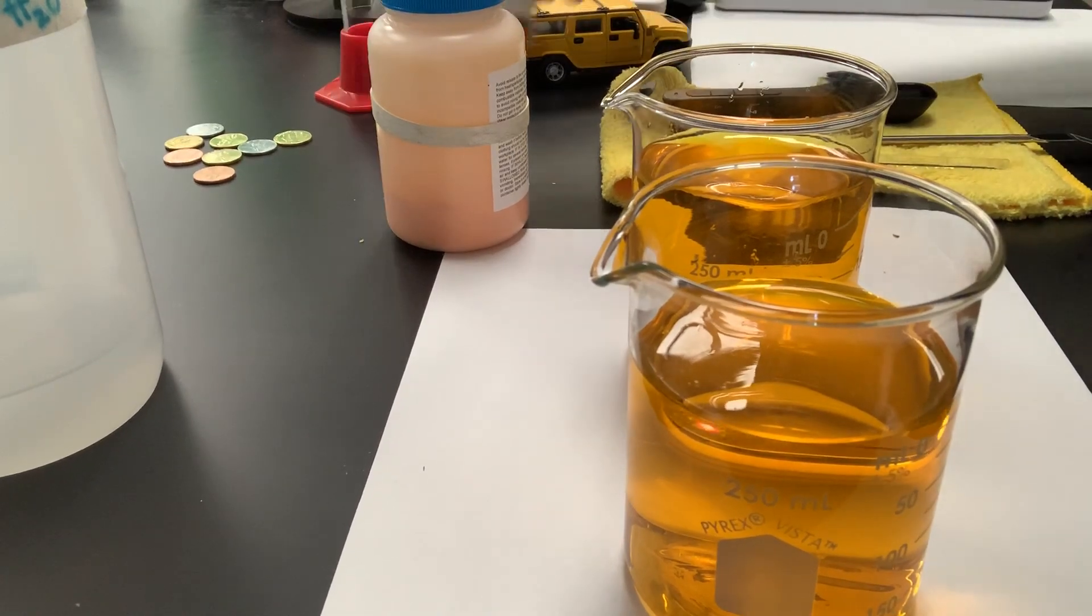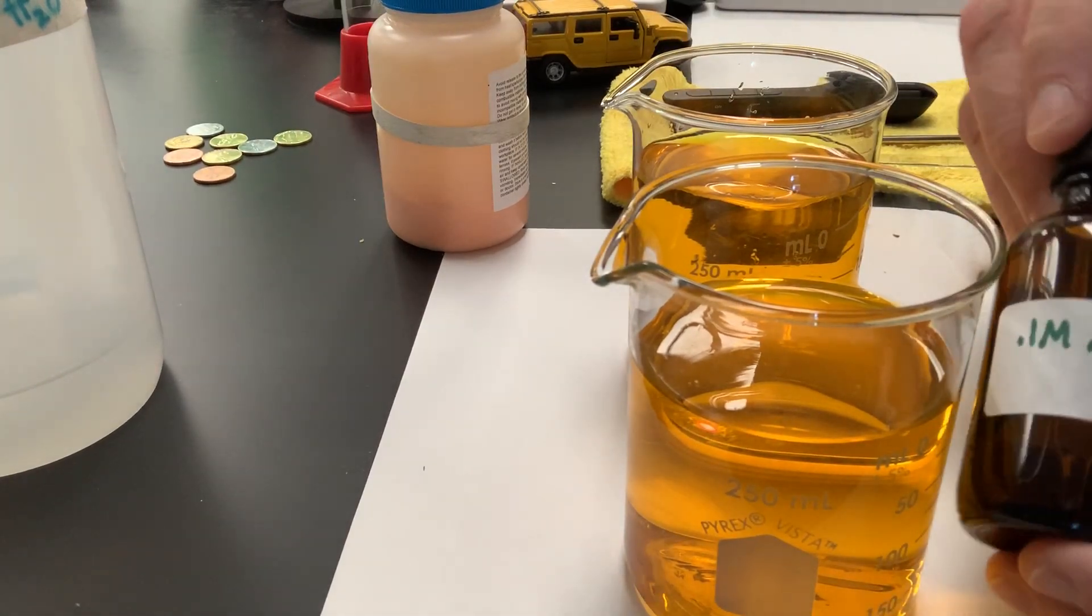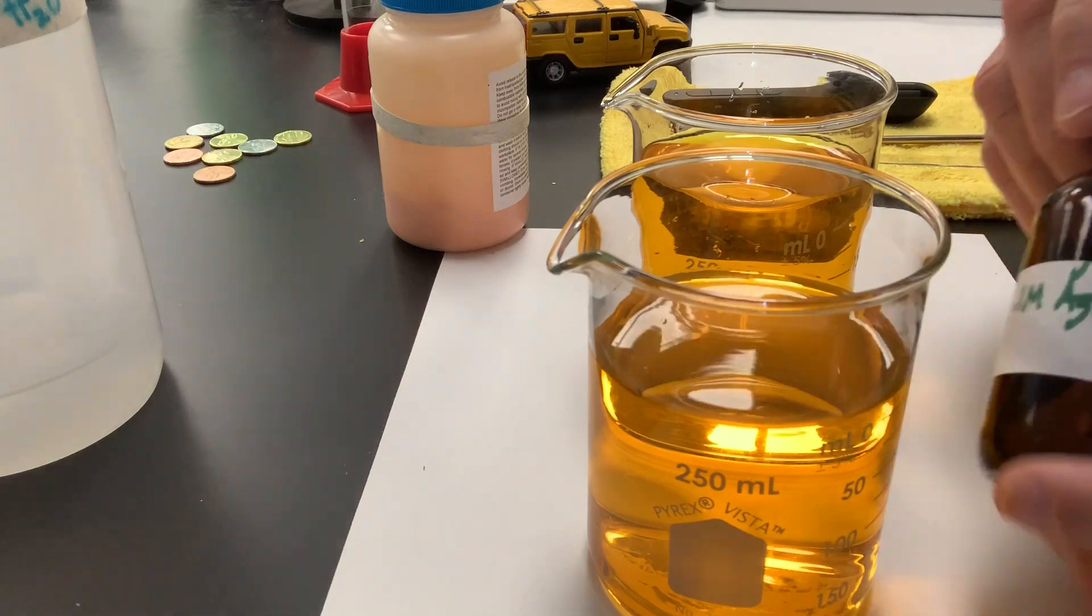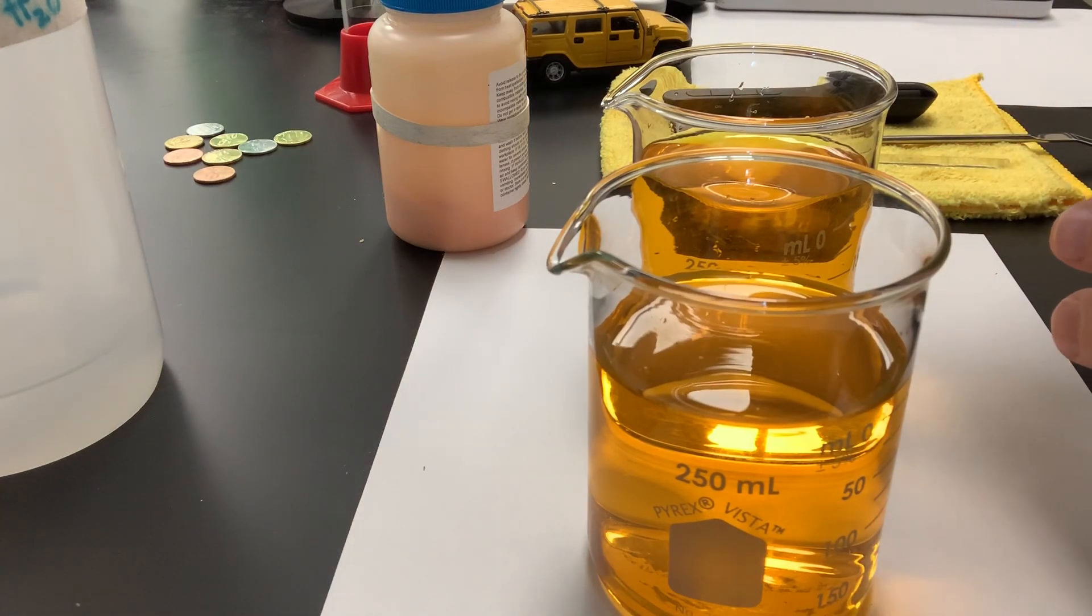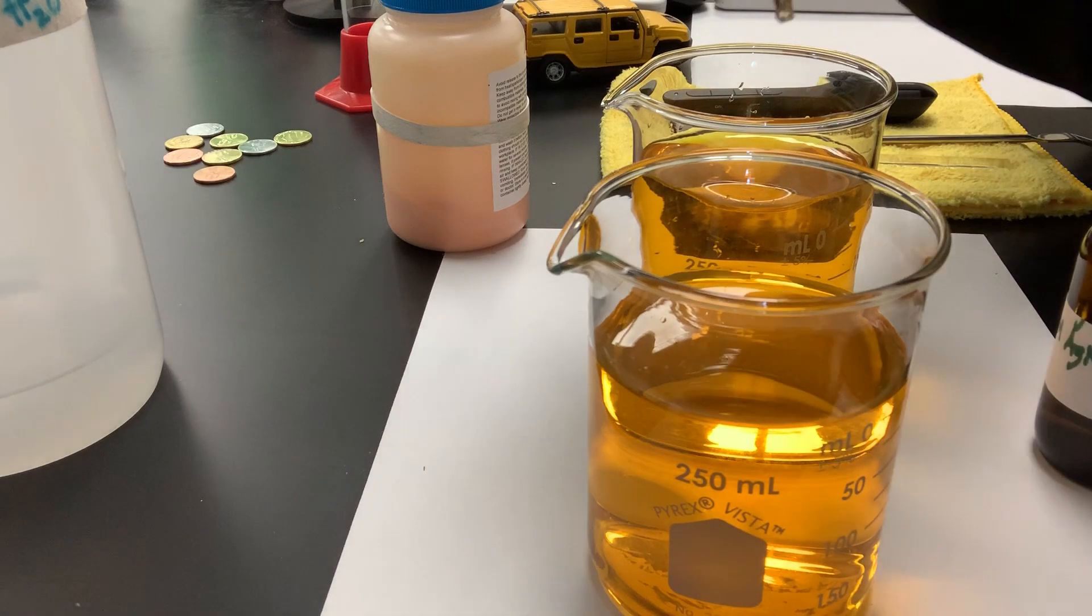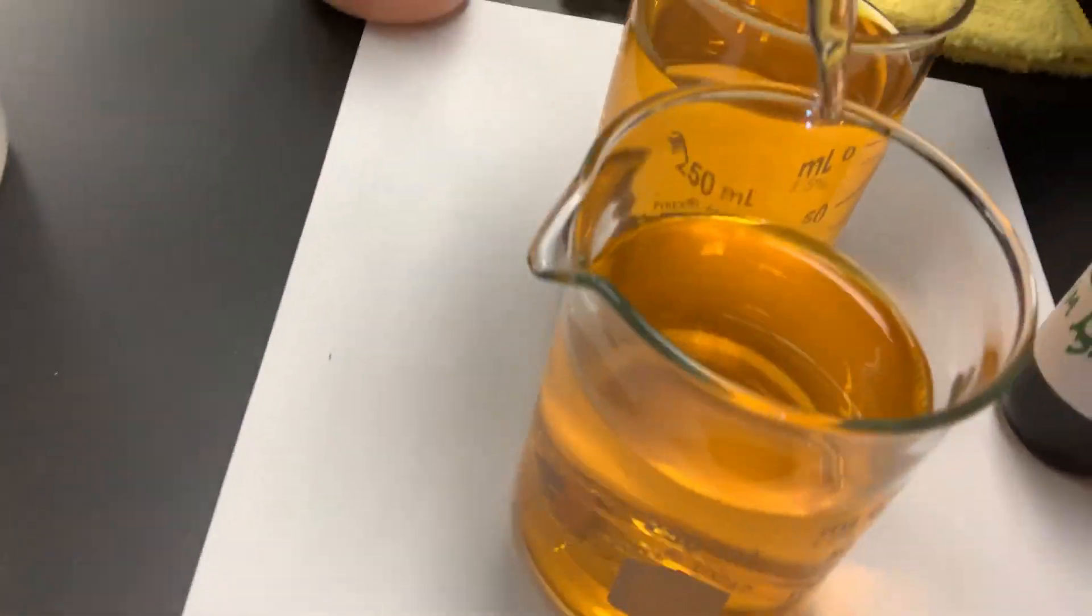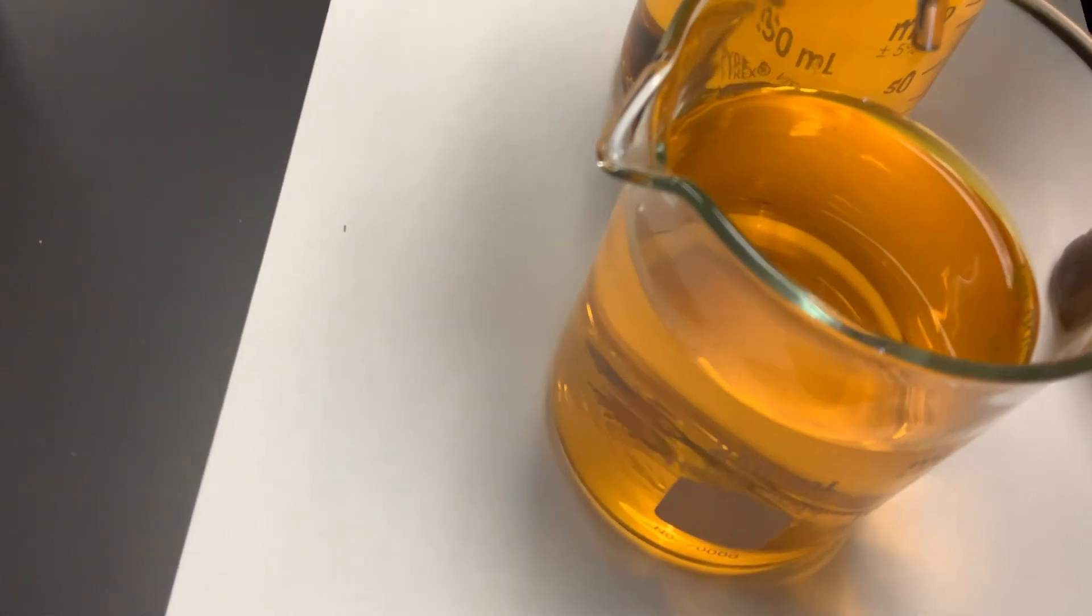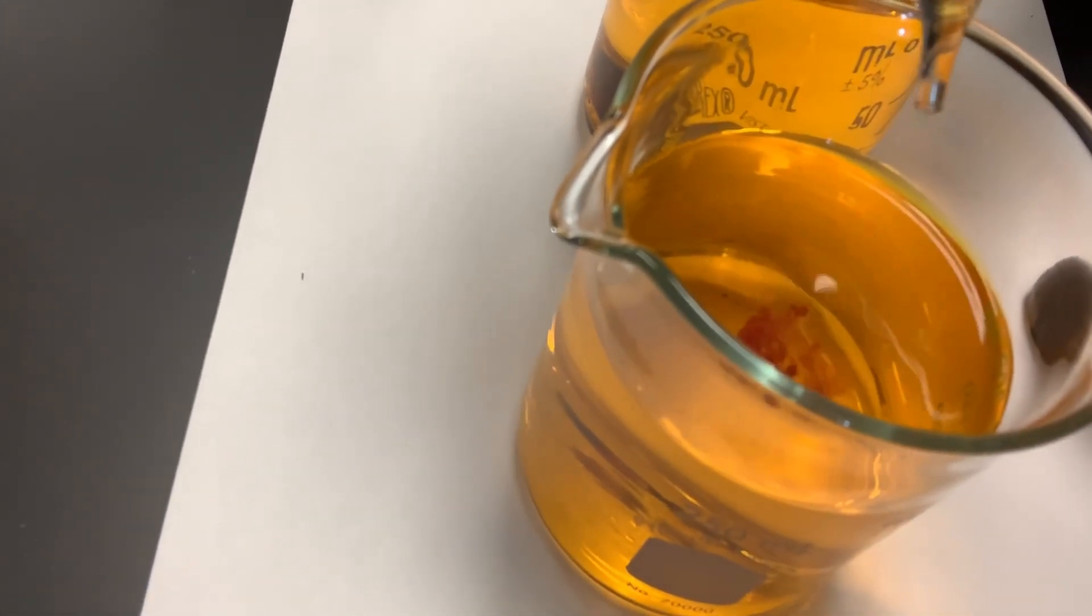To one of the beakers now, I'm going to add another homogenous mixture. This is silver nitrate dissolved in water. And I'm just going to add a few drops to one of the beakers. And we're going to form what's called a precipitate. It's a solid forming in solution. Sort of fun to watch. So I'll put the camera over top, and you'll be able to see that precipitate forming.